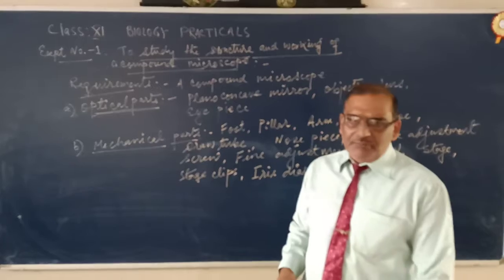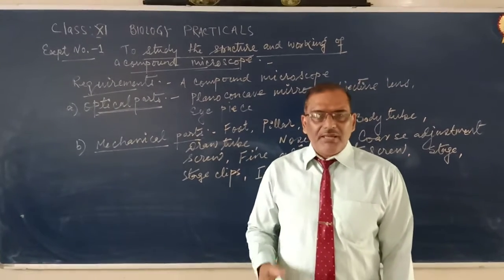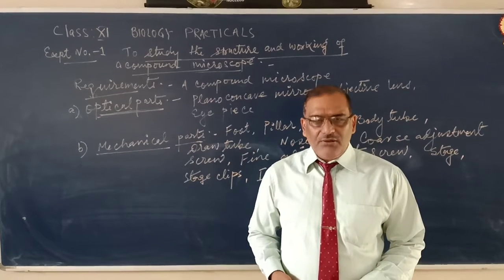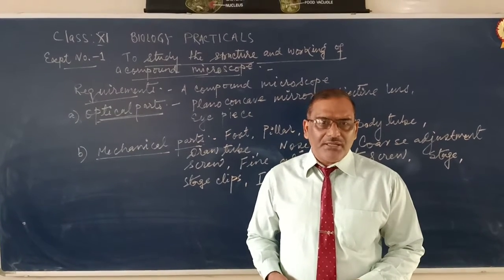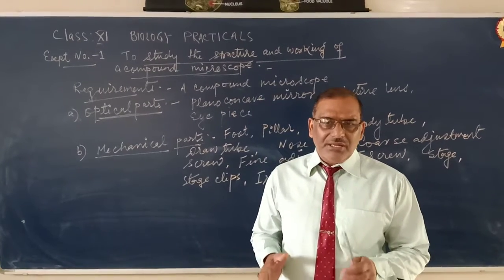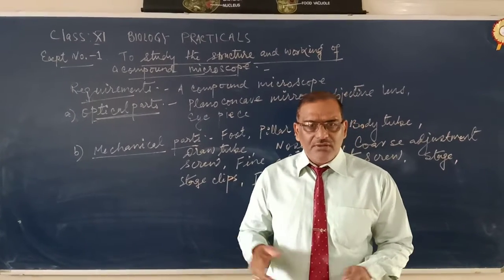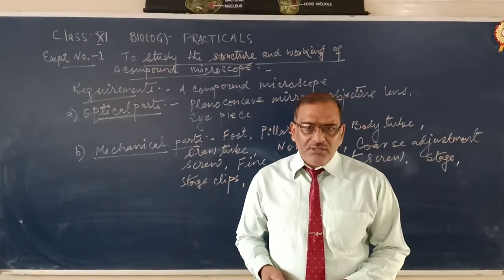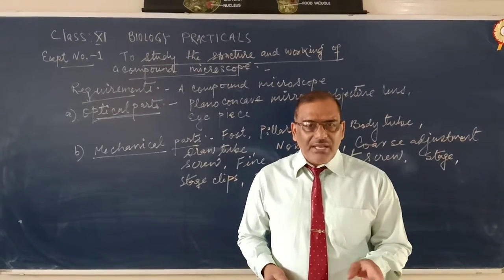You might have seen simple microscope and compound microscope in class 10. In class 10 also you might have used simple microscope and compound microscope. So there are some differences between simple and compound microscope, which I can explain to you practically by showing the two types of microscope, simple and compound.